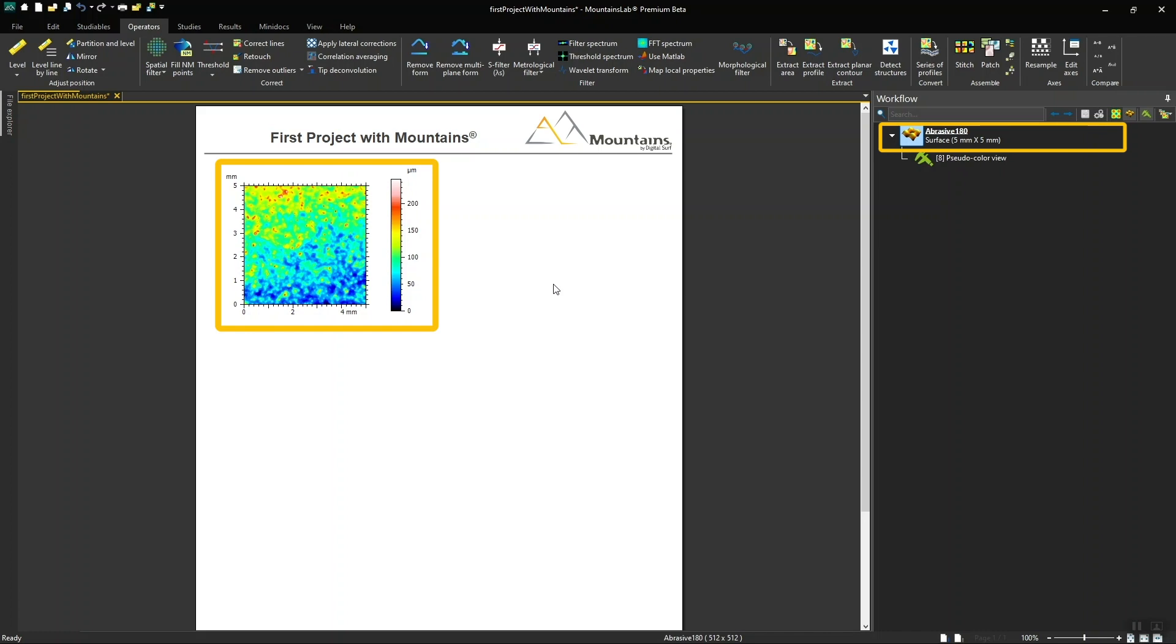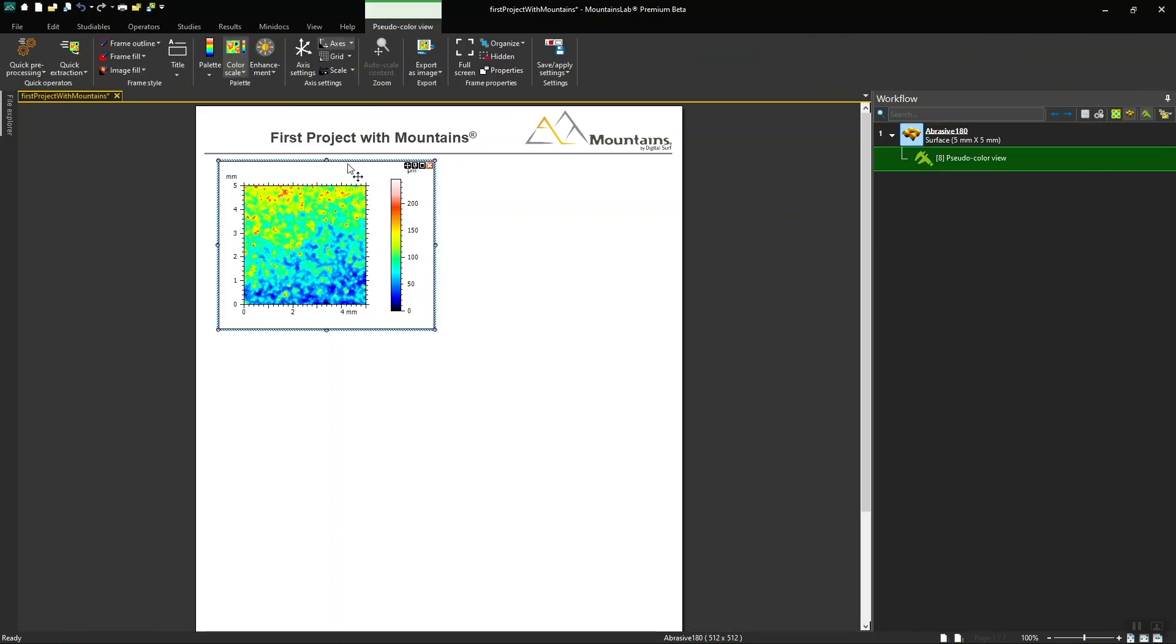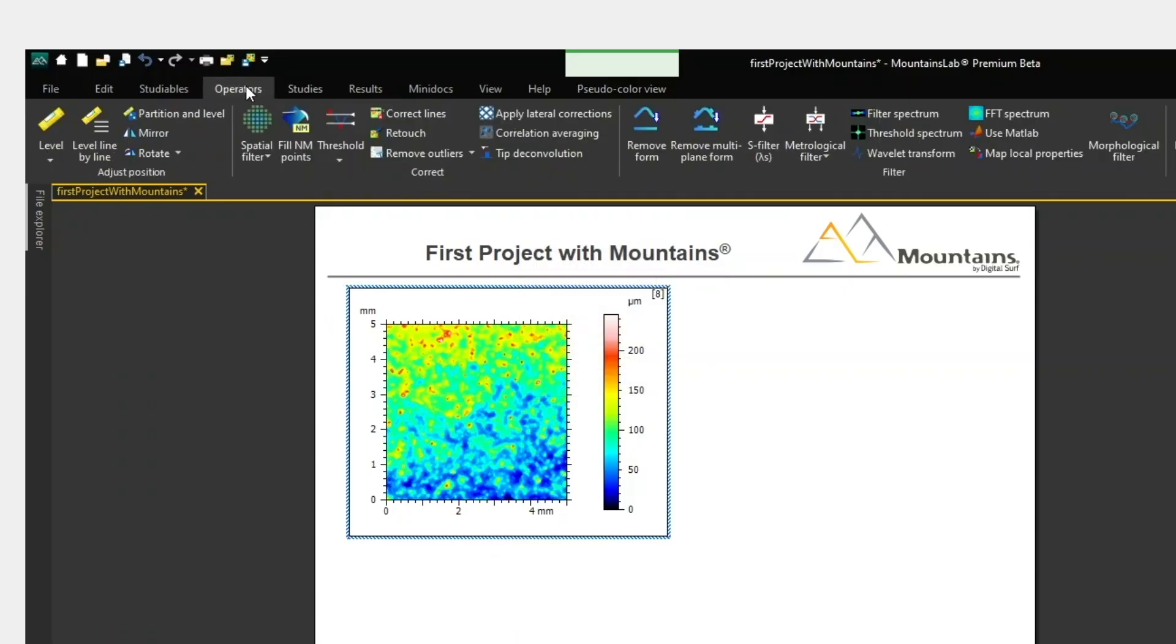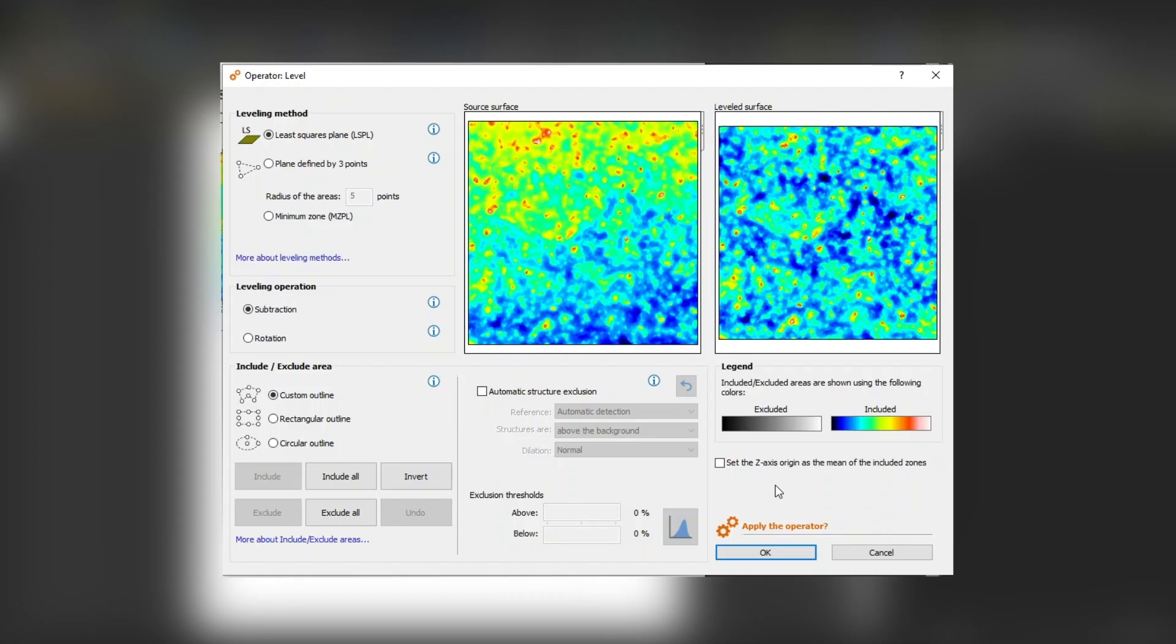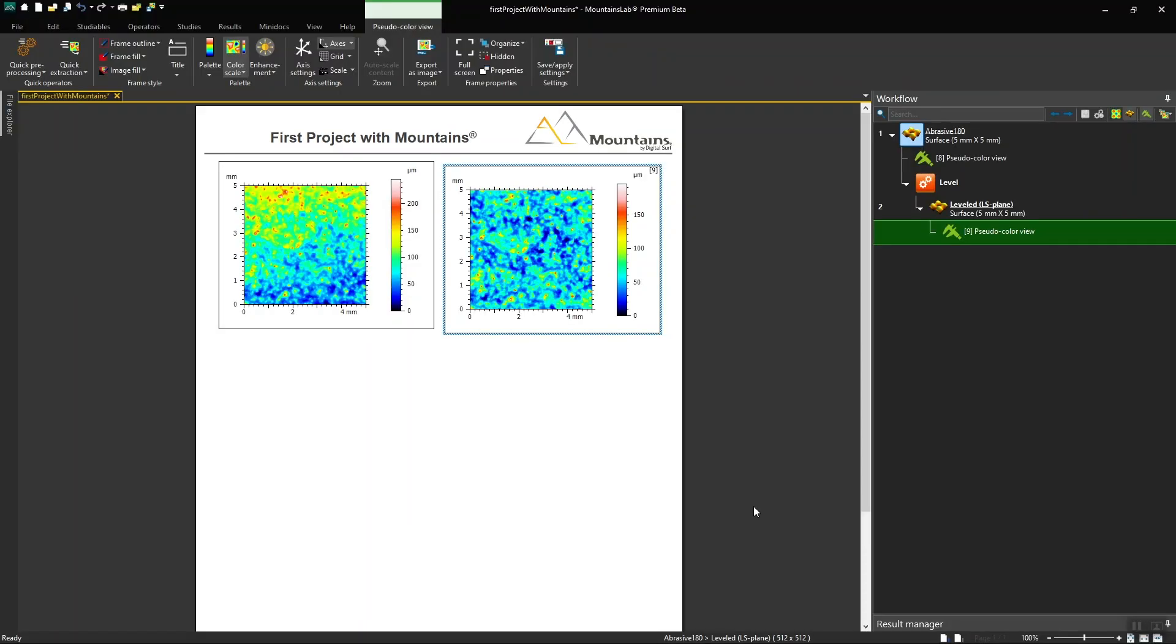The first thing we want to do is correct the slope on the studyable by leveling it. In the Operators tab, I'm going to choose the Level tool. The Operator dialog opens and I can choose the options I require and apply the operator. The corrected studyable is then generated in the document.